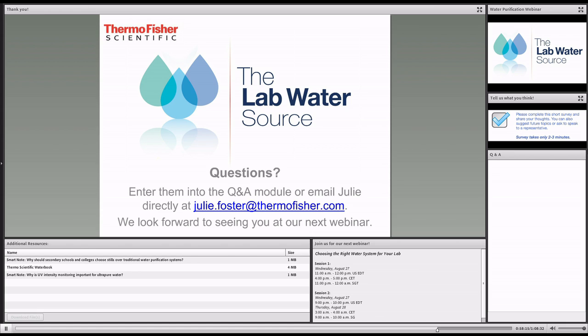And the way that you'll be able to monitor that, again, kind of depends on what manufacturer you have. But normally there's a menu option. You can go into the menu and you can actually see what the conductivity or resistivity of the water is before and after the EDI cell. So you could kind of diagnose a problem there.